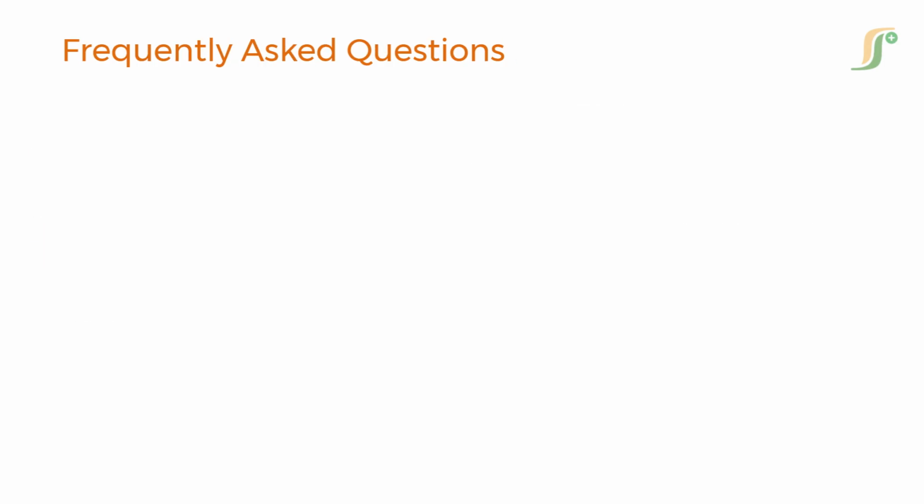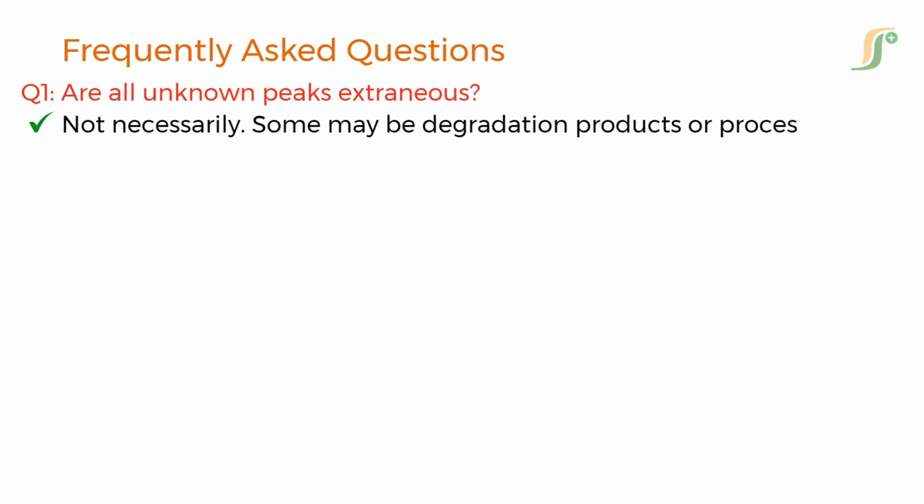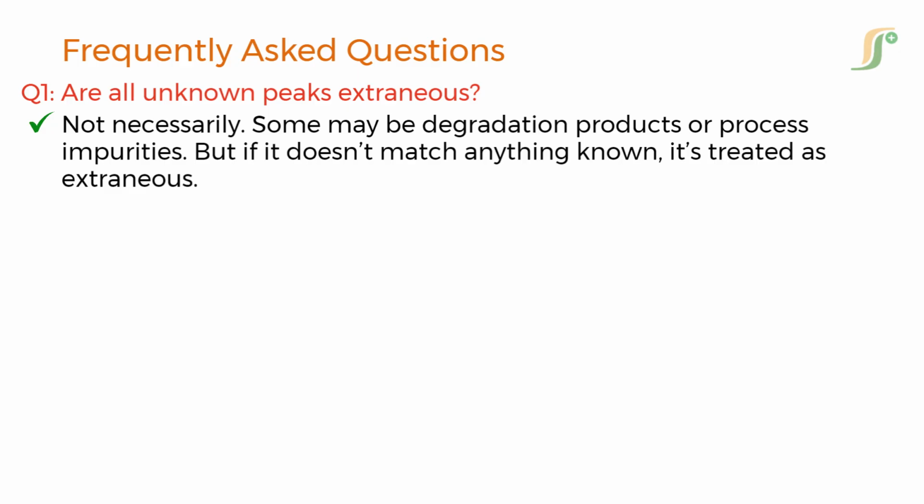Here are some frequently asked questions on extraneous peaks. Are all unknown peaks extraneous? Not necessarily. Some may be degradation products or process impurities. But if it doesn't match anything known, it is treated as extraneous.